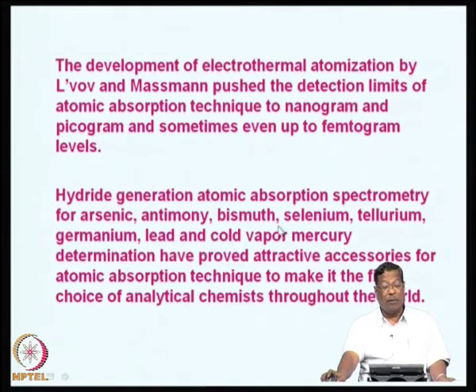And cold vapor mercury, what was described in 1920s, that I had explained to you just now, the cold mercury vapor determination, it is useful for picogram levels of determination of mercury, especially to make it the first choice of analytical chemists throughout the world.